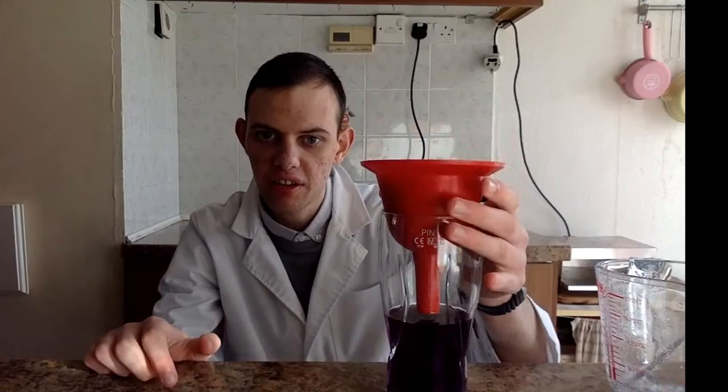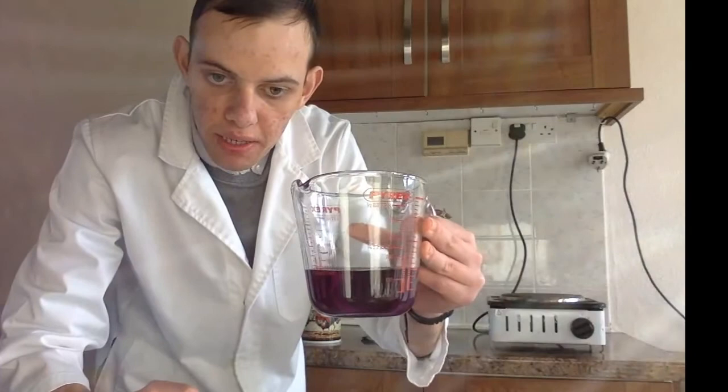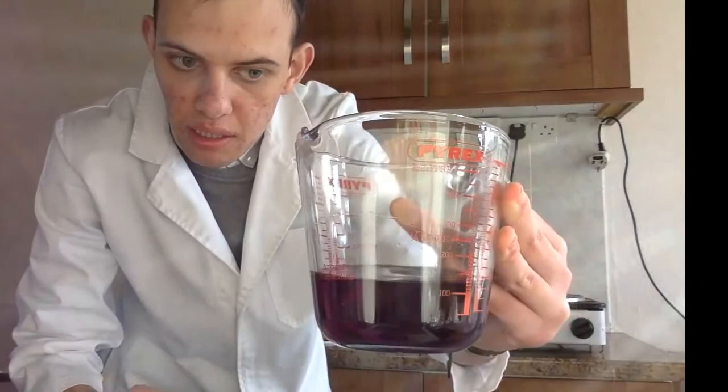Ten minutes have passed since I started my gravity filtration and I believe it is about done. Now what we have in the funnel is just plain sugar, which you can put in the bin. I have finally finished gravity filtering my vanilla sugar, and over here it should just be the methanol with the vanillin.